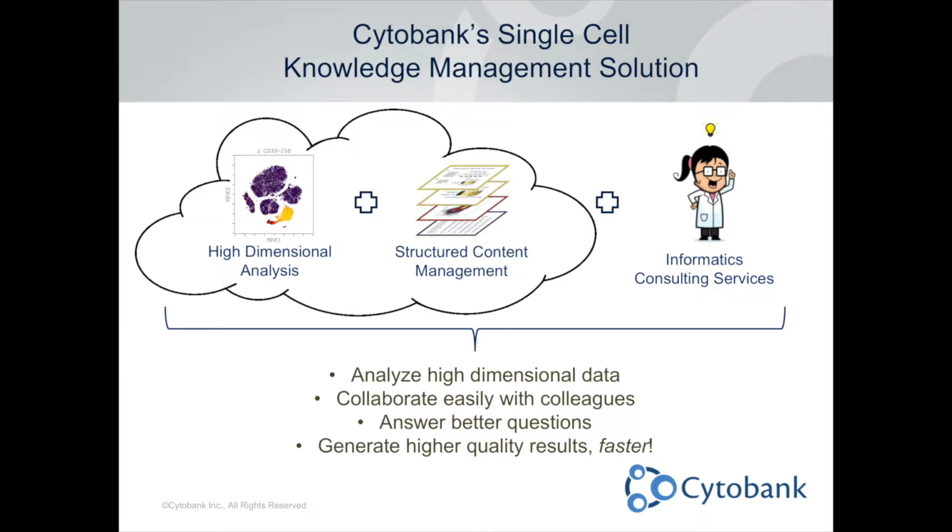And then in addition to our software, we also have an informatics consulting group that does analysis for customers on a project basis. I won't be talking about them very much today, but keep in mind if you have questions, we're happy to answer them. Just send us an email by going to support.cytobank.org.